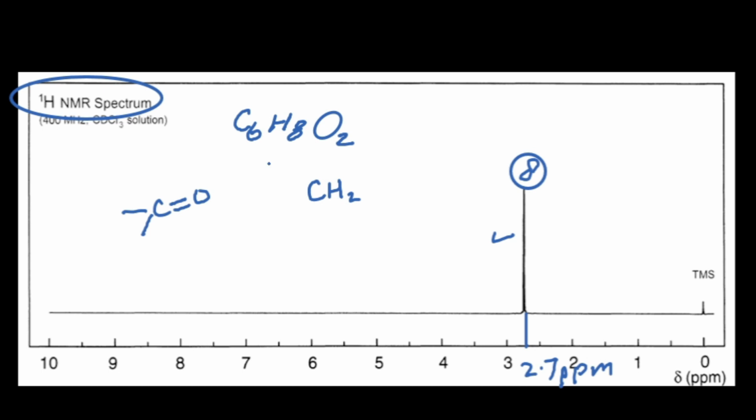So it means you will find a structure that has two types of carbons, one type of hydrogen, and the carbonyl group also in your compound. So 8 hydrogens are present. If 8 hydrogens are present, it means there may be 4 CH2 groups. Why are 4 CH2 groups present? As the hydrogens are of the same chemical environment and only the CH2 group is present, your hydrogens should be attached to the carbon, and at a time 2 hydrogens should be attached to the carbon. So it means that in your compound 4 CH2 groups are present, and it is confirmed.